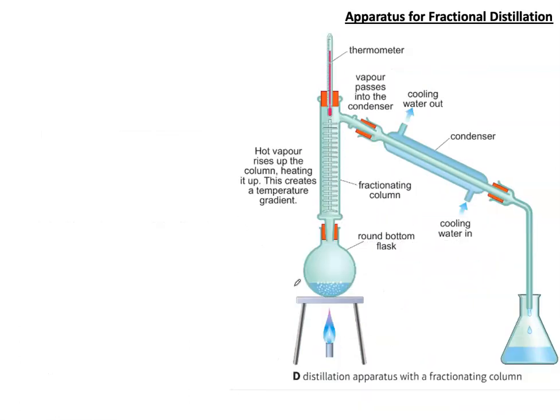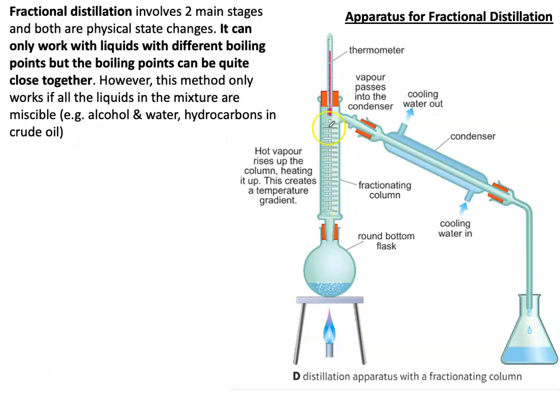Let's look at fractional distillation. The only difference between simple distillation and fractional distillation is you've got a fractional column, which is cooler at the top, hotter at the bottom. The rest of the process is exactly like the simple distillation.